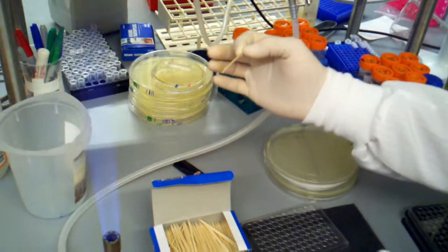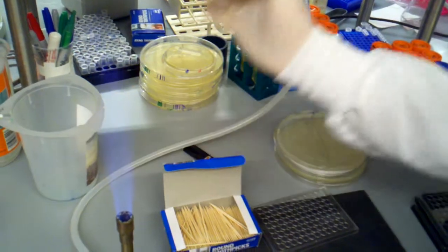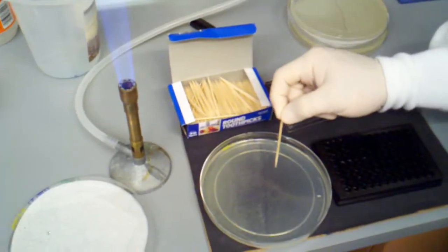In order to actually inoculate one of these wells, you're going to grab a toothpick, quickly flame it, and then you're going to pick a single colony.